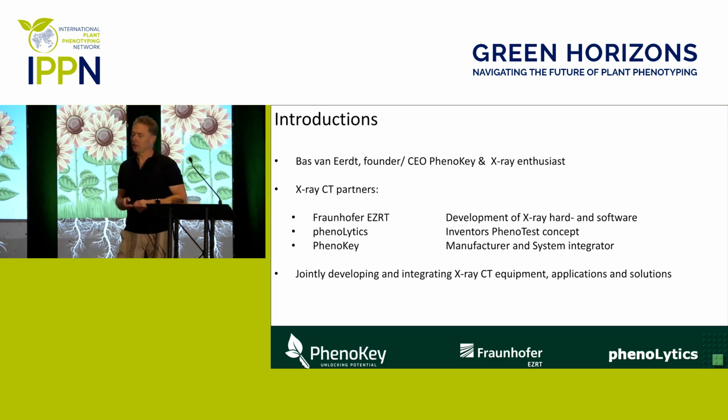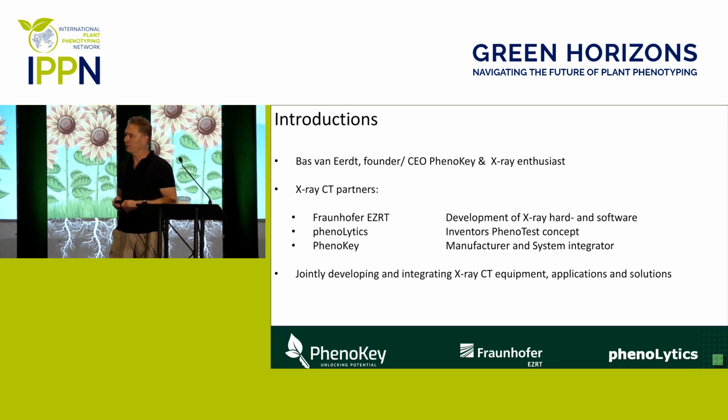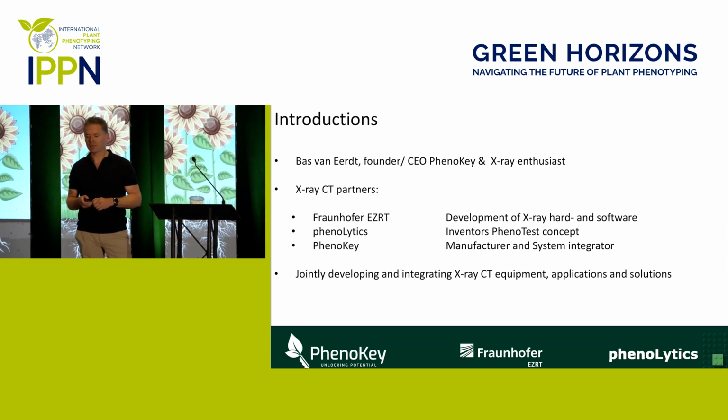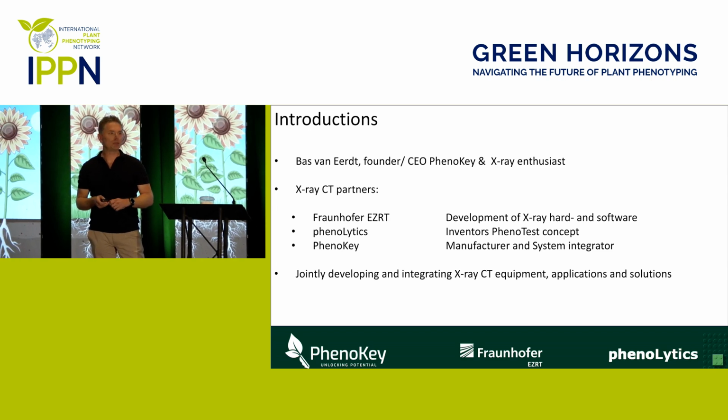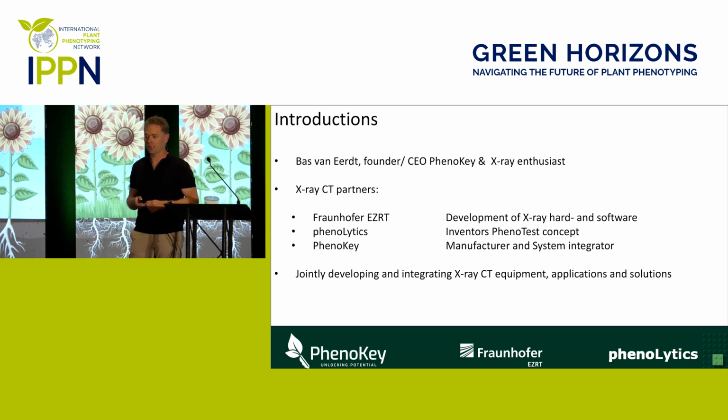Today I'm also presenting on behalf of some other partners. So that's Fraunhofer IIS from Germany. That's part of the Fraunhofer Gesellschaft, one of the largest research institutes from Europe. And they're dedicated to developing Xray CT hard and software solutions, in this case specifically for the plant and agricultural domain.